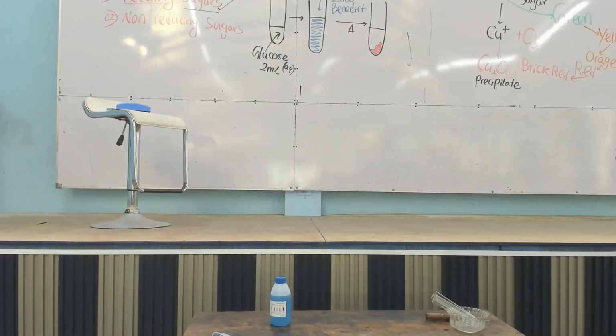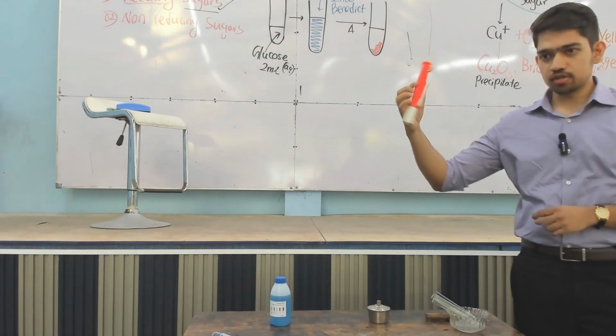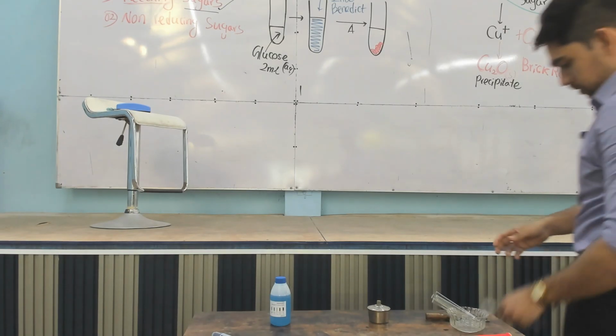Okay, and to heat everything, since I don't have a Bunsen burner here, I'm going to use a sort of small spirit lamp. Then this is a sort of high tech pipette filler that I can use to suck liquids so that I can use them in the experiment.